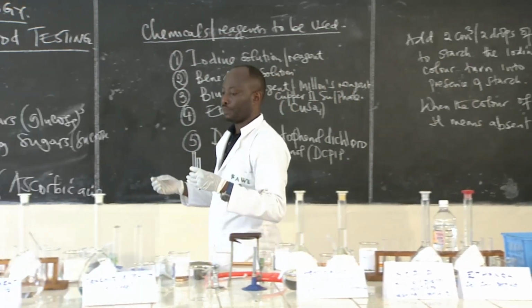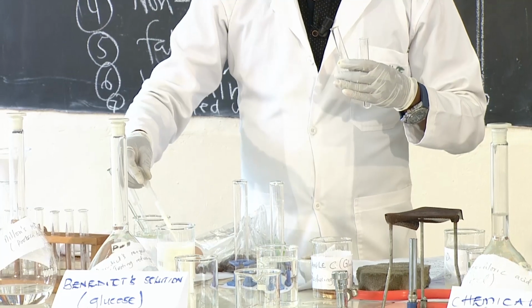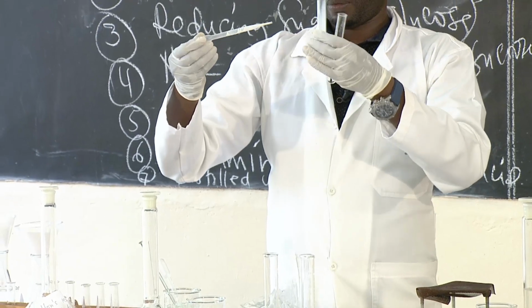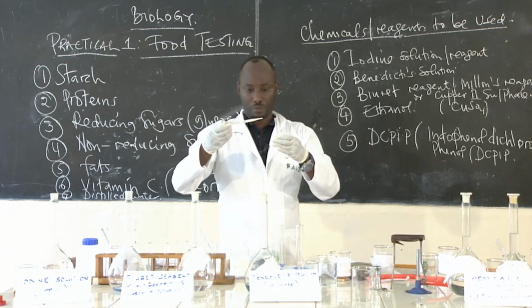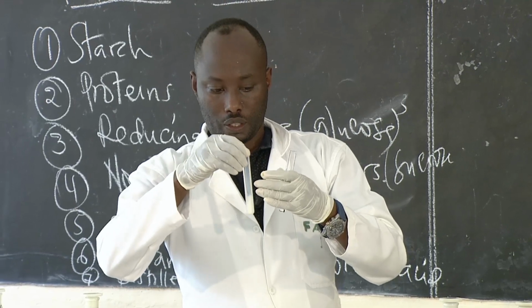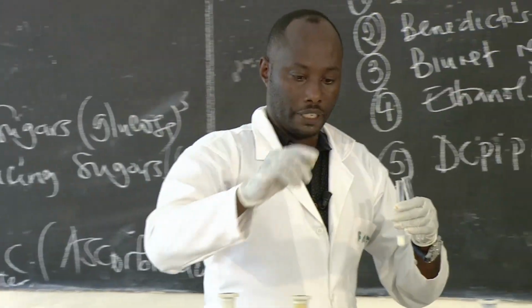Am I sure that milk contains proteins? Let me just repeat the experiment, I think. There's no need to repeat the experiment. I think I can add the Biuret solution.